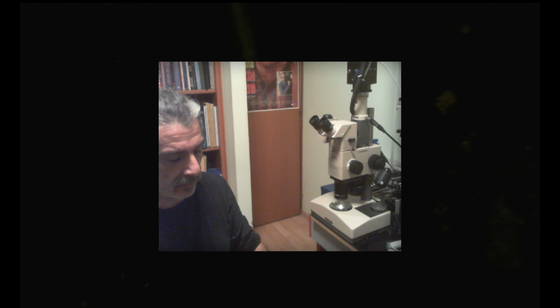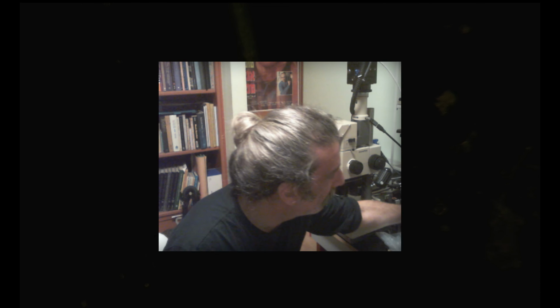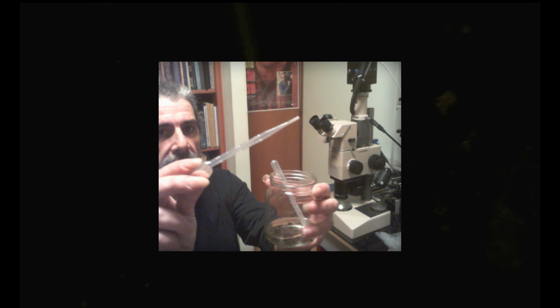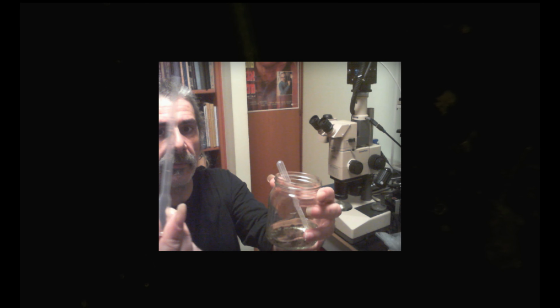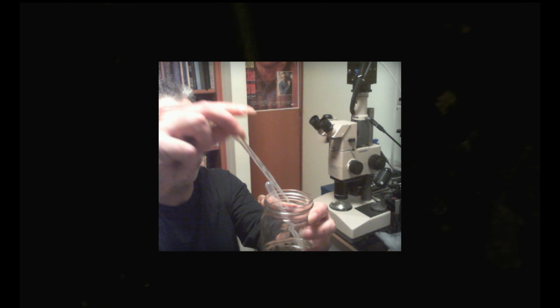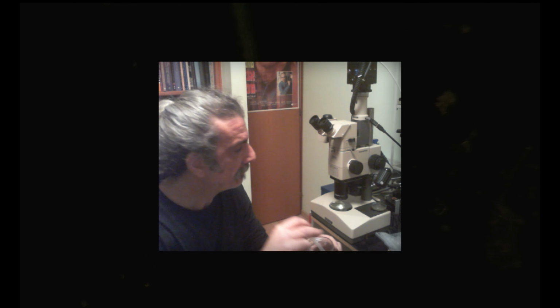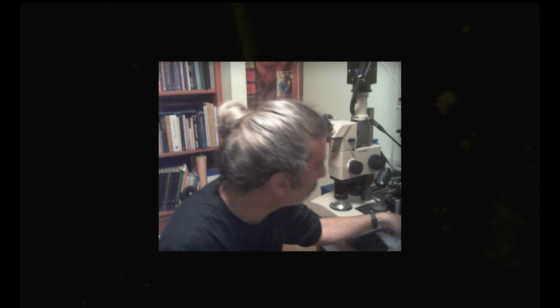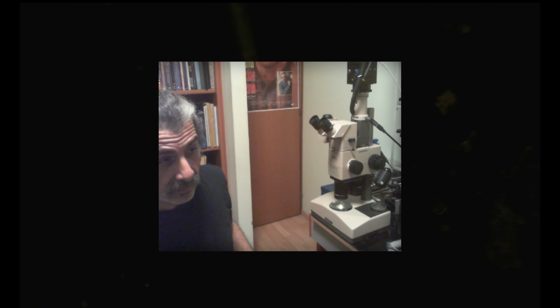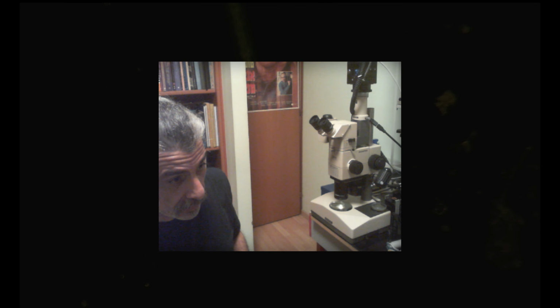And for transferring from, let's say, a jar to our petri dish, we've got those disposable, very cheap pipettes for large volumes. Okay, that's the tools. Now let's talk a bit about illumination.